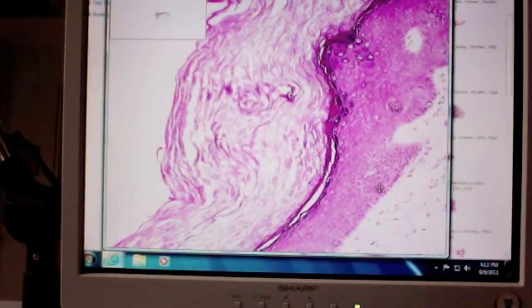Do we have to know how to identify a duct in those? No, but just conceptually, to let you know that these are not little isolated structures just stuck in the tissue. They have a bottom and a top end, and because they're exocrine glands, that duct is going to have to go up to a surface eventually. I would not give you a duct, pointing at one of those little things and asking what this is. Once we've done integument, skin, absolutely I could do that, because by then we've learned all of the different structures that make up the skin, and you should be able to recognize it then.